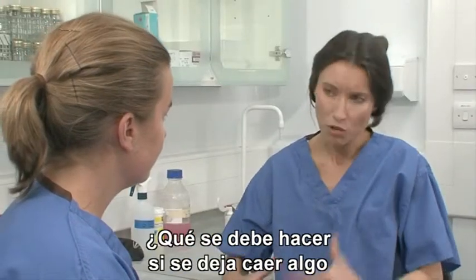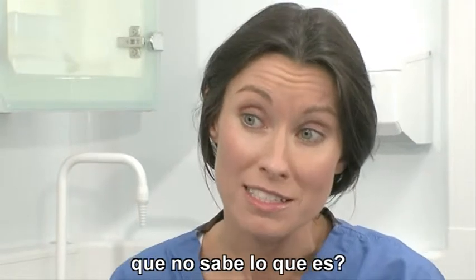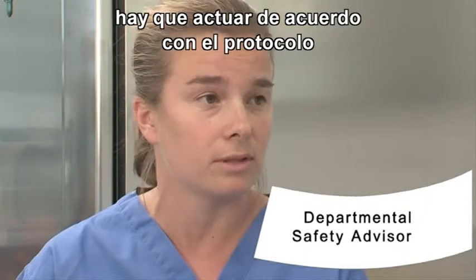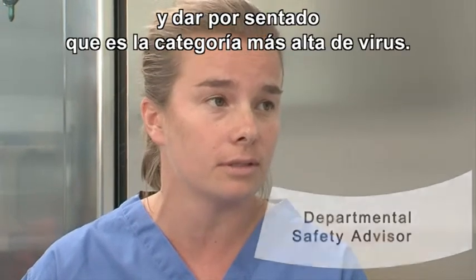What should you do if you drop something and you don't know what it is? If you spill something and you're not sure what it is, then you need to act according to the protocol and assume it's the highest category of virus.